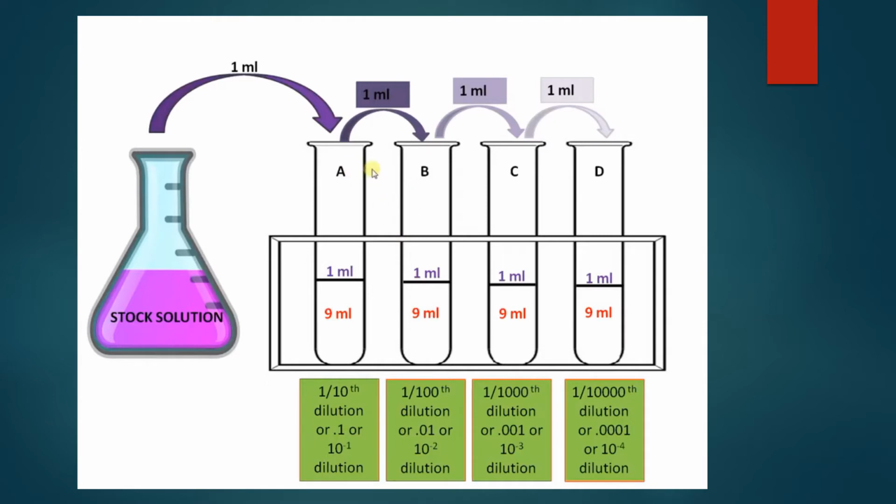And this is especially used in the case of bacterial culture. If we want to prepare a plate method or a streak method, we need to dilute the stock solution. This is a procedure of choice so that we get a minimum number of colonies on the plates.